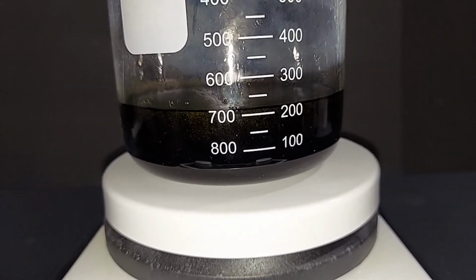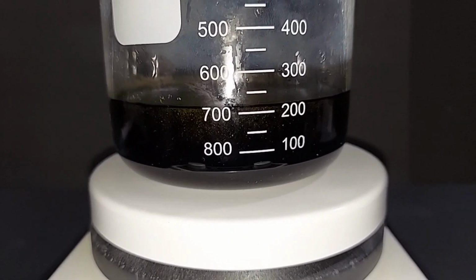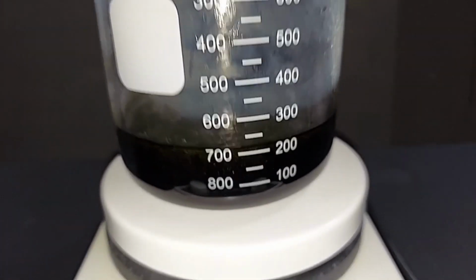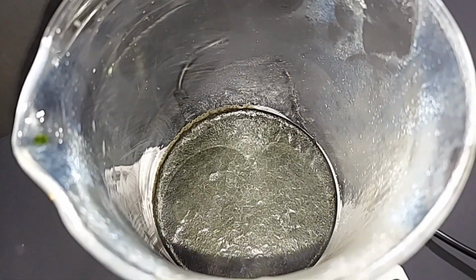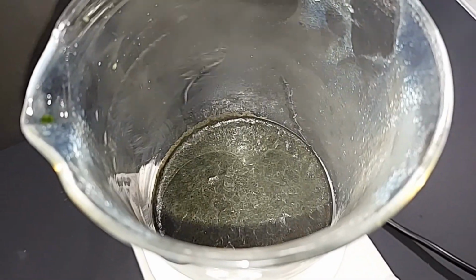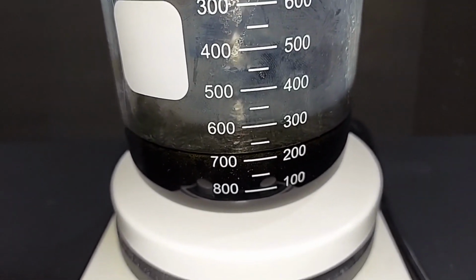I was checking this every 20 minutes, and I just came back, and it's right at, I'd say, 210 milliliters, maybe 212. It's just a guess. But then I looked on the inside, and we have the copper 2 chloride crystallizing right there, kind of the magic number. And I'm pretty sure this is saturated enough I can just let it cool down. So I'm going to just do that, and when it's fully crystallized, I'll be back.